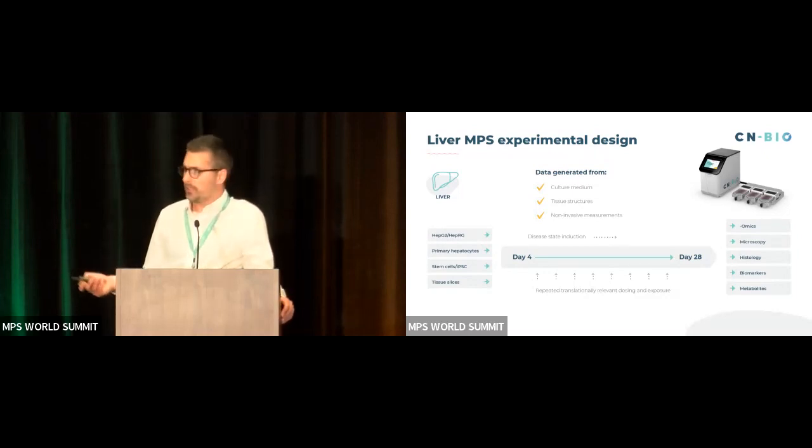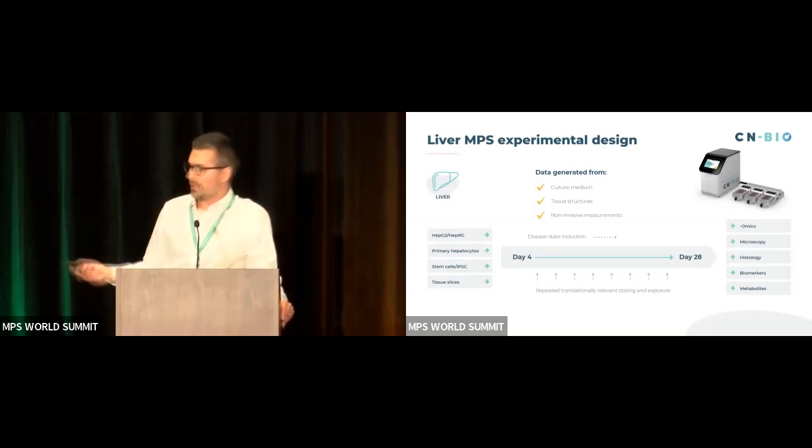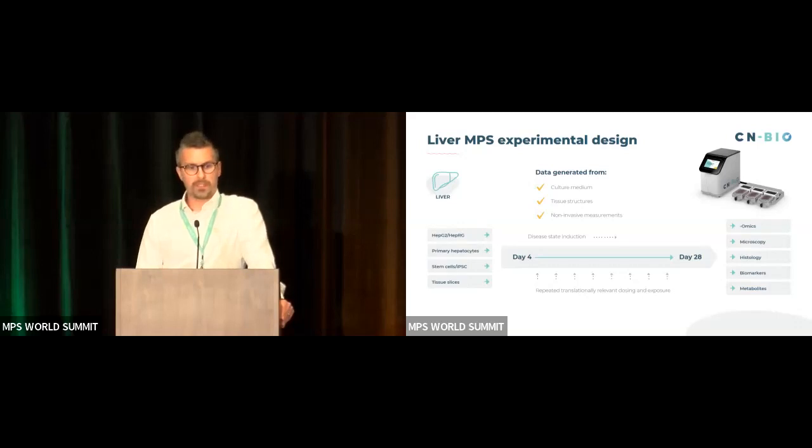And this model typically uses, as I say, primary human hepatocytes, but it's not limited to that. We use the system with stem cell-derived materials or even clinical trial samples now to recapitulate their function. And we can do a wide variety of endpoints, as I'm going to show you, to assess liver functionality.